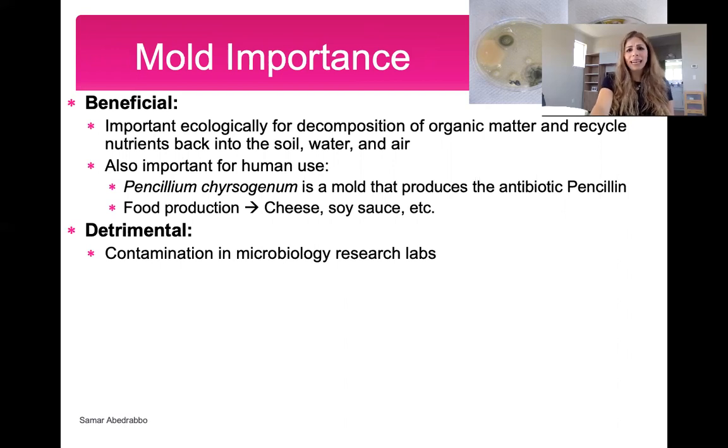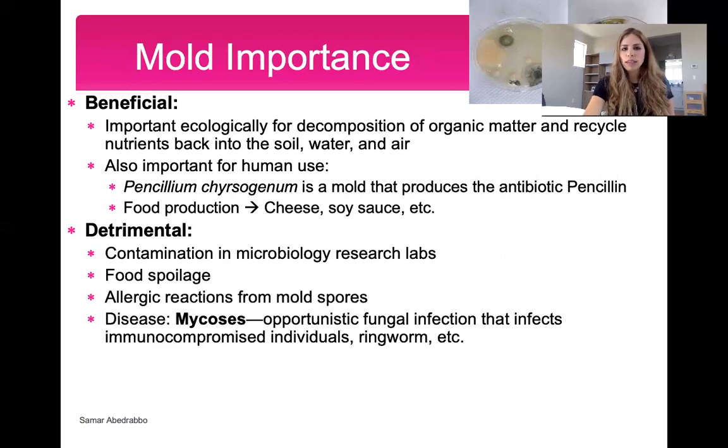They are really bad for contaminating certain labs. If you work with bacteria in lab, when you have mold contamination, it's really tough because it's very hard to get rid of them. So they're a source of contaminants in various research labs. They can cause food to spoil, as a lot of you have seen, and they can cause allergic reactions. A lot of people are allergic to mold spores.